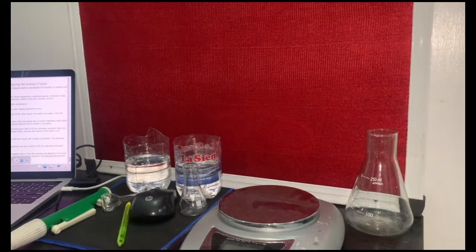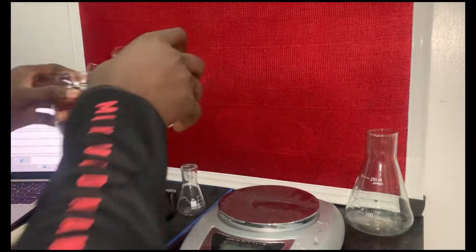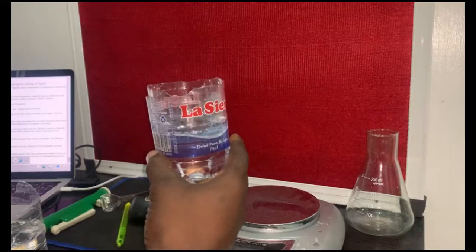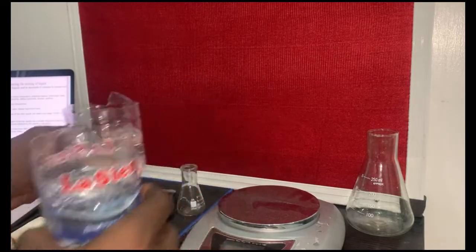Just like we know, practicals require that we have our apparatus and our reagents. So I think I have some of them here to present to us. I'll start with the reagents. In this experiment, since we are checking volume conservation when mixing two liquids, we have two liquids here. The two liquids we're going to be making use of are alcohol on my right hand side, and water on my left hand side.